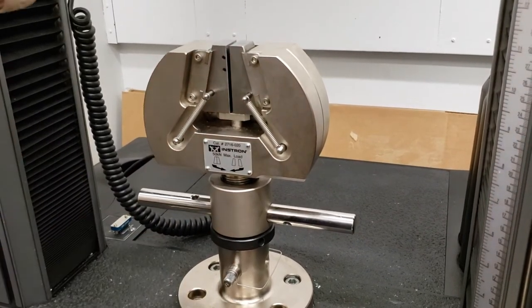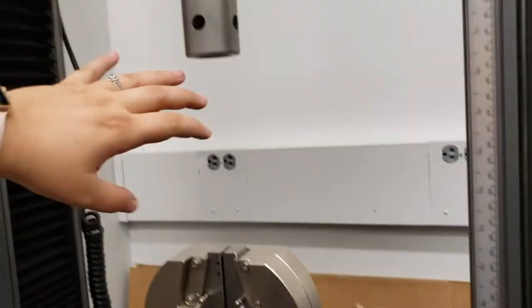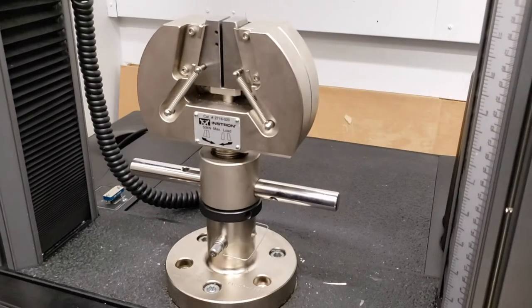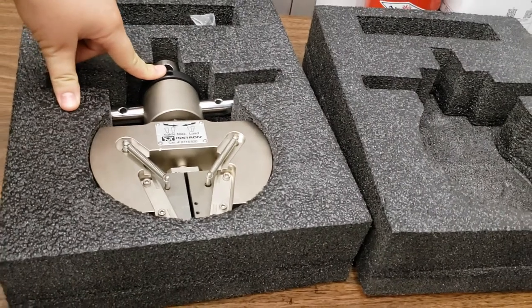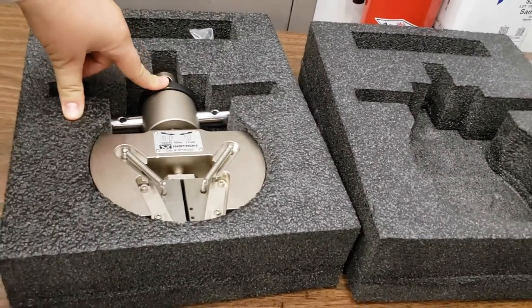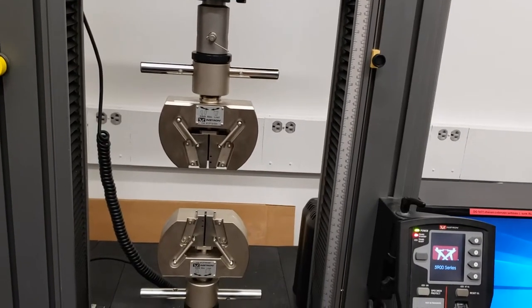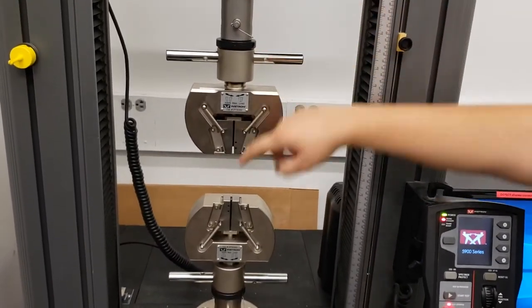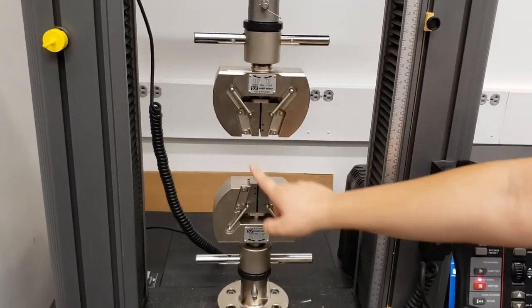I'm going to install the top fixture. The order is: put it in, put the pin in, put the clip over the pin, then rotate this piece upward against the machine to minimize wobble. I now have both fixtures attached — this one screwed upward, this one screwed downward, so we're not getting any wobble. They're nicely aligned. That is the nice thing about getting things directly from Instron or professionally made items — they line up nicely. There are sometimes issues with homemade attachments that don't line up quite as well.